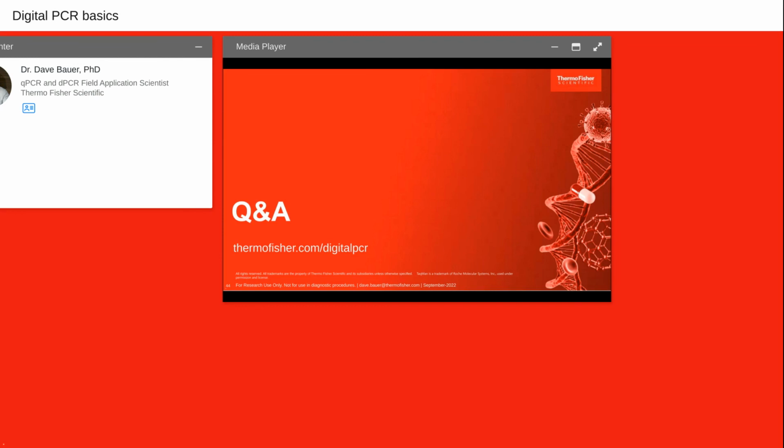All right, thank you, Dave. We've got time for a couple more questions. Your next question, do I need to redesign my existing real-time PCR assays or change how I typically design assays to use absolute Q?